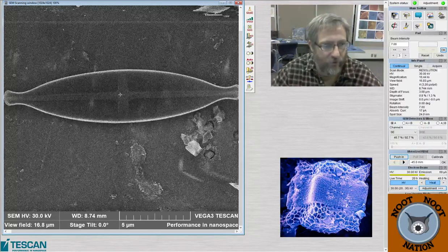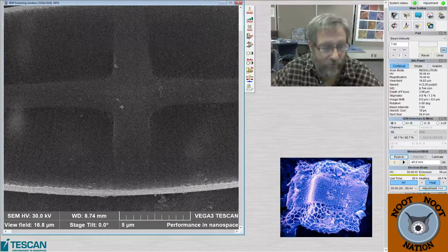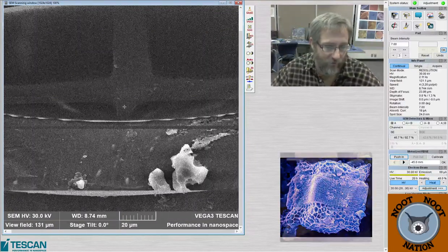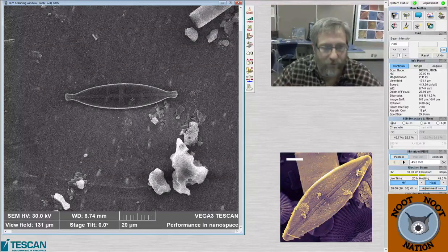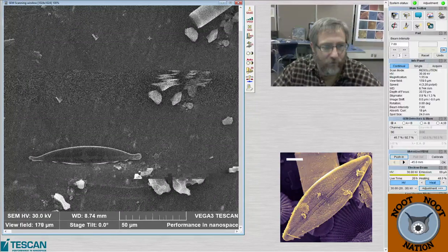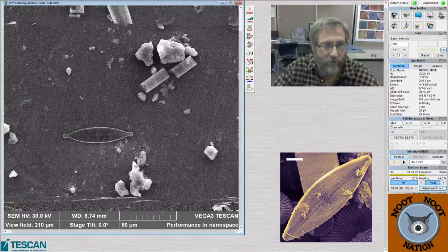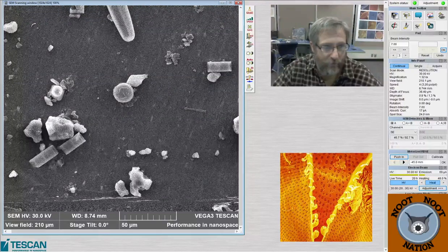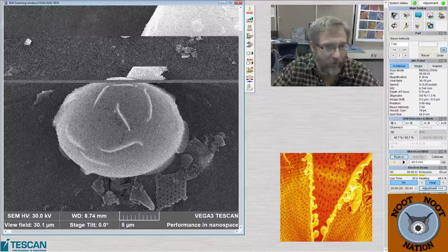And then you need typically a sputter coater, which has a target that's gold. And we maybe go through one a year, and each one is about $800. So, you know, that's expensive, but only once a year. So it ends up not actually being a lot of money.